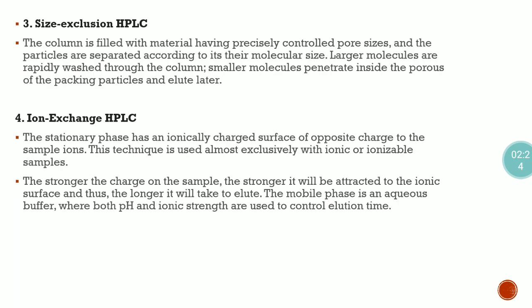Third one is size exclusion HPLC. The column is filled with material having precisely controlled pore sizes and the particles are separated according to their molecular size. Larger molecules are rapidly washed through the column. Smaller molecules penetrate inside the pores of the packing particles and elute later.